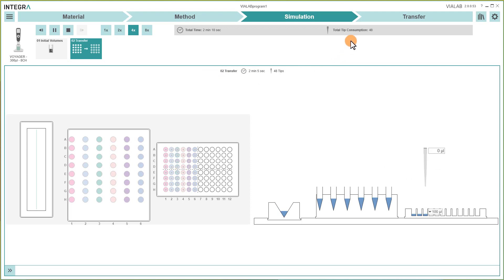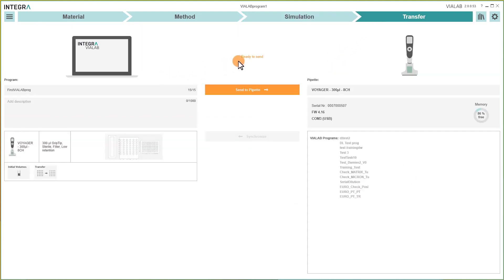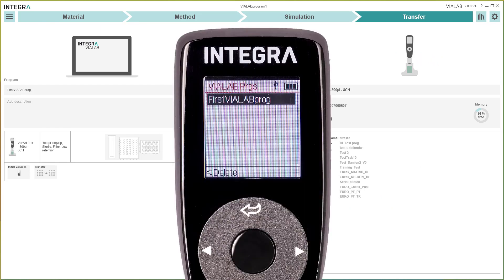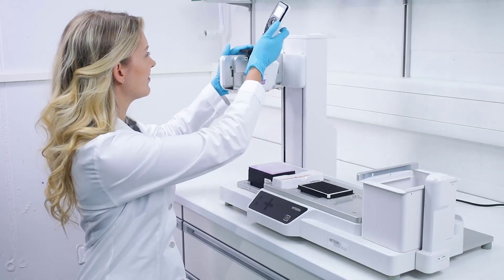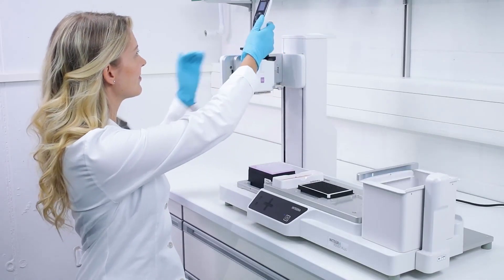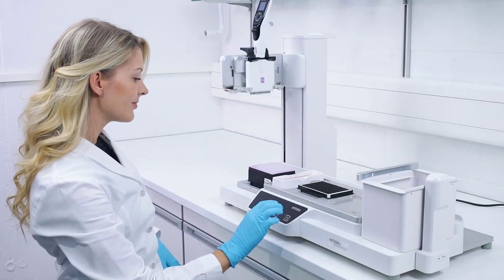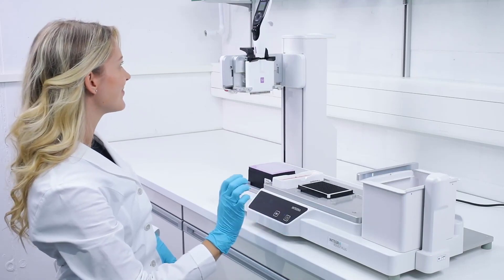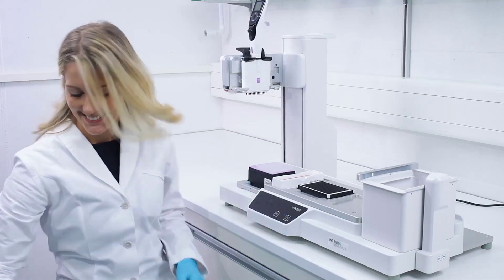Select the last section Transfer to transfer your program to the pipet. Connect your pipet to the PC via USB or Bluetooth and send the program directly to it. Clip the pipet in the Assist Plus and let your new assistant do the work.